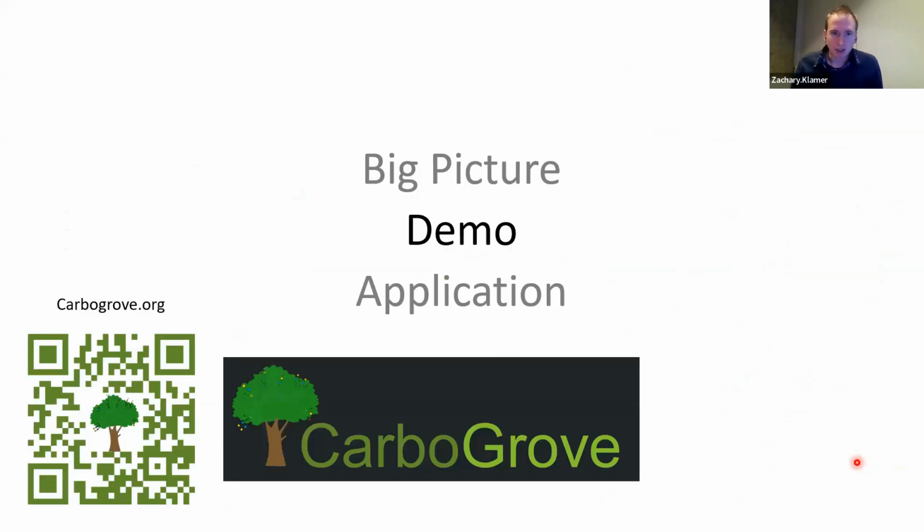With that, I would like to go ahead and jump into our demo section here. You can follow along with me if you want at carbogrove.org, or you can use this QR code here to access the website. We don't have a mobile version of the site right now, but the desktop version is pretty accessible on mobile still, so I think you'll find that useful. So I'm going to stop sharing my slides here, and I'm going to share the website now.